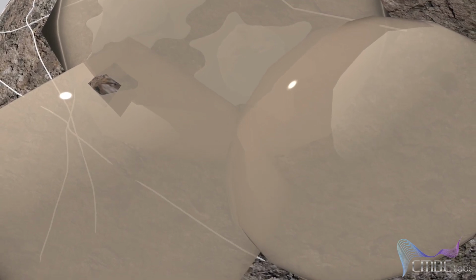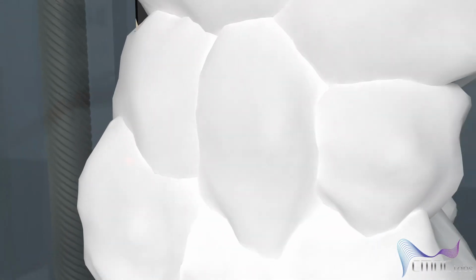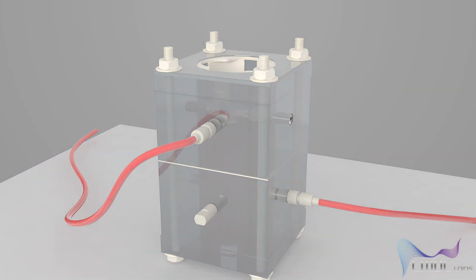be quantitatively assessed based on their ability to synthesize new bone matrix through the formation of matrix proteins such as type 1 collagen and minerals such as calcium phosphates and carbonates. The formation of woven bone on the implant surface can be visualized microscopically after 1 week and concludes the proliferative phase of osseointegration.